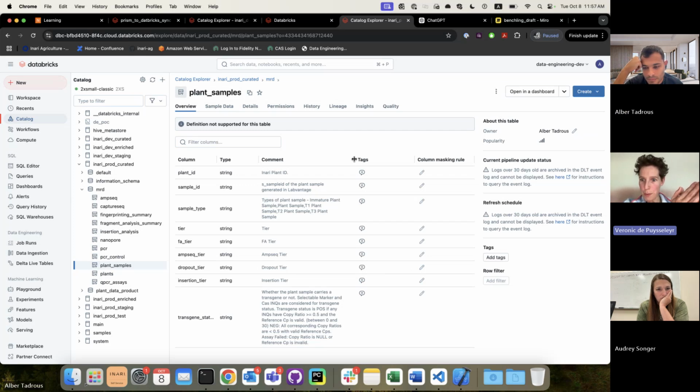So then we have issues. It's a bit more complex. Also at the plant sample level, I understand why they want to have it to interpret the AMP-seq results. It's handy if you know whether or not the editing machinery is in there. If the status is negative and you see editing, that's very strange, because without editing machinery, you cannot have editing.